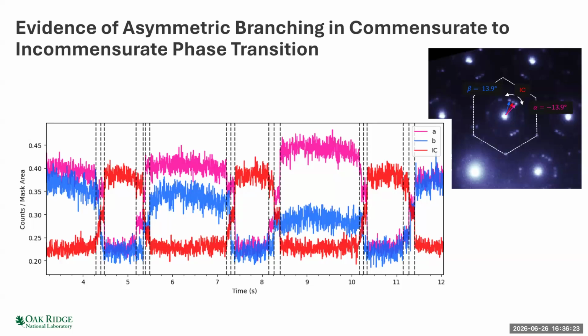It's interesting because you get this data, and in this case it's just standard diffraction data, but because it's all time-stamped, you can go back and rebin your data to get enough signal to noise. So you can look at how your phases are changing as you change the temperature. This was actually 3 heating and cooling cycles that I've done here.